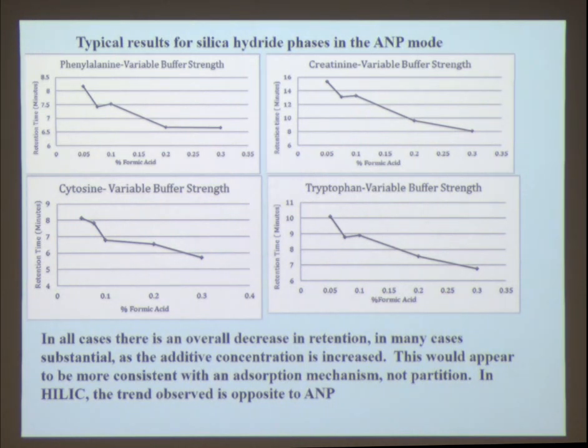You may think that may not be that important, but it actually is from a practical point of view, because an increasing number of people who are using LC are using it in conjunction with mass spectrometry as the means of detection. It's much more specific, in many cases more sensitive than other types of detection systems. However, if any of you have ever run an LC before, one thing you notice is if you're running a solution through your ionizing medium for the mass spectrometer and you have a lot of salt around, it begins to condense on your ionization source. And you have to clean it very often.